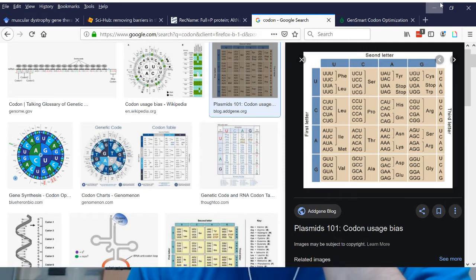Now, why it's considered a mammalian plasmid is because it has the proper promoters, terminators, and all that other stuff to make it work in mammalian cells, which not all DNA has. So that's something that you really got to be thinking about. So pcDNA, it's a plasmid map. We can get it from Addgene. So that means I think we can get it in SnapGene, right?